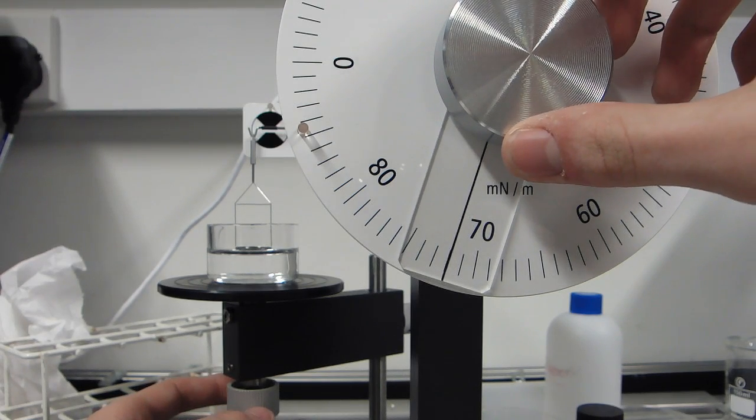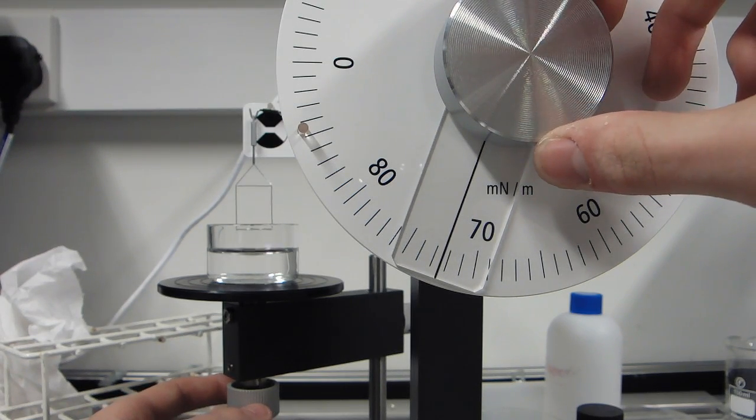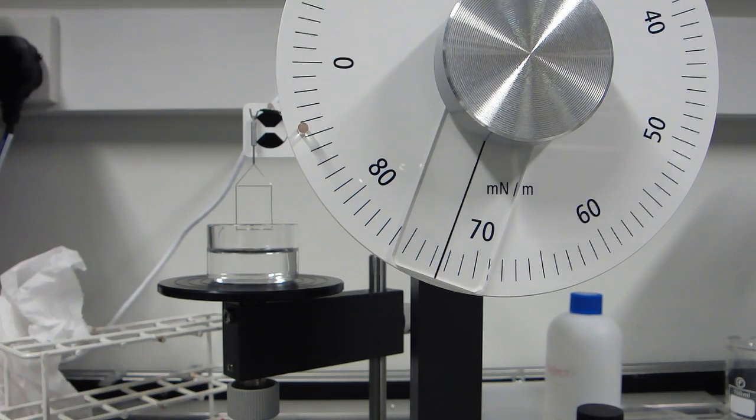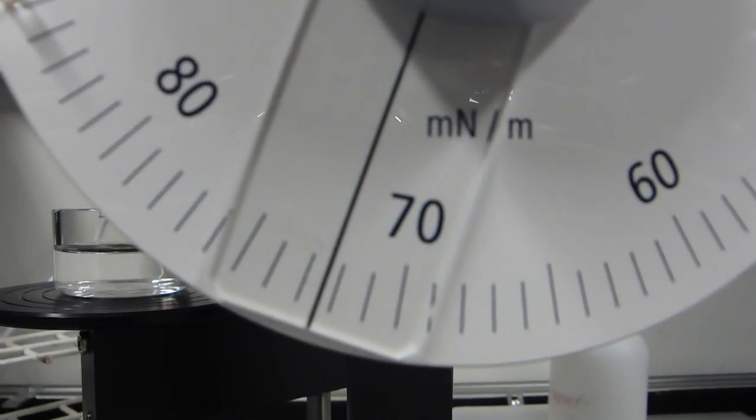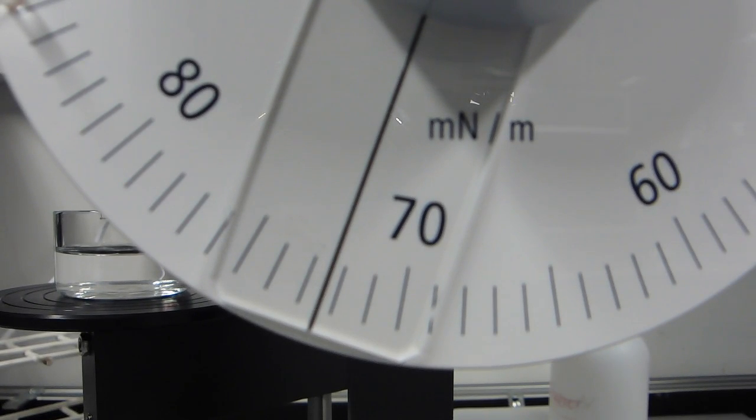When the ring breaks free from the surface, we can read off the result from the scale. In this case, the result is approximately 72 mN per meter.